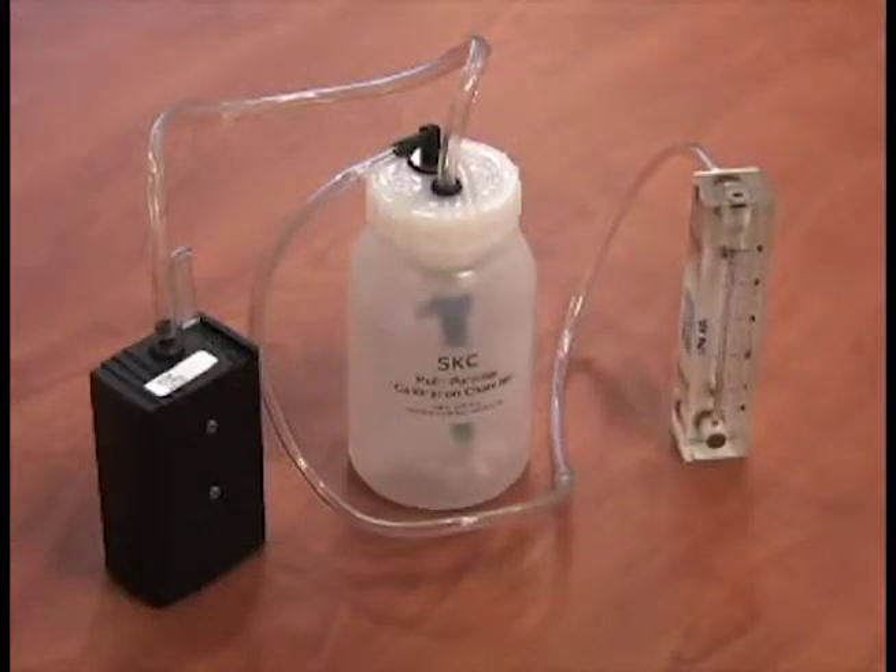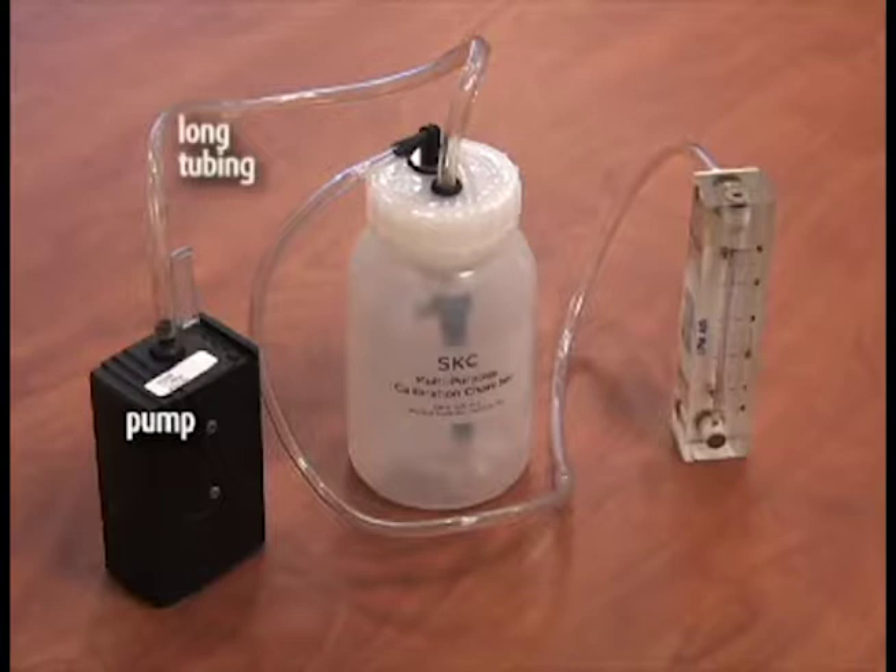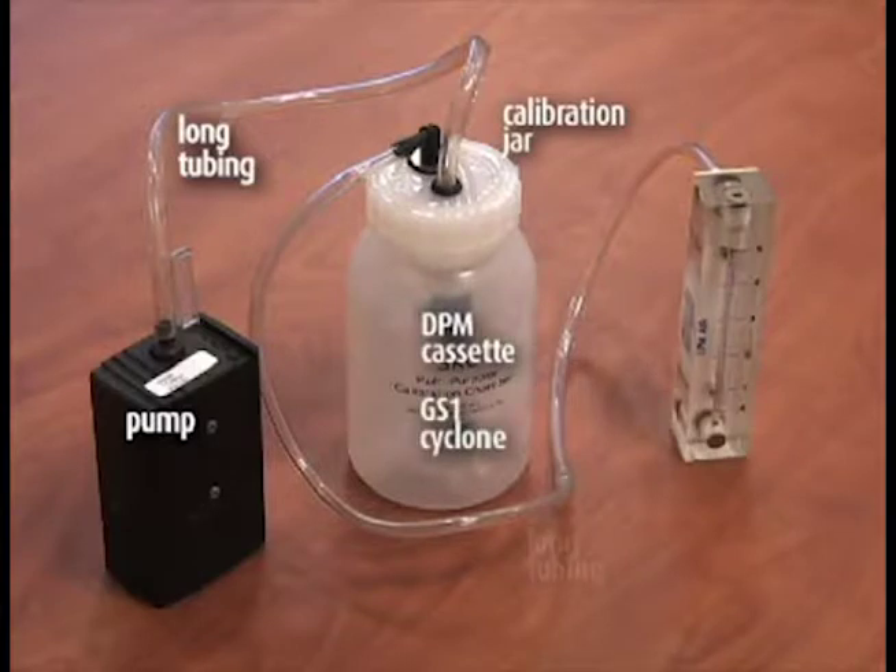Set up the pump with the correct media in line, with the field rotometer as shown. The order of the components for calibration is: pump, long piece of tubing to jar inlet, calibration jar, DPM cassette, GS1 cyclone, and long pieces of tubing from the jar outlet, and rotometer.